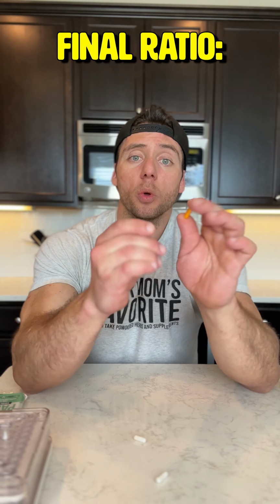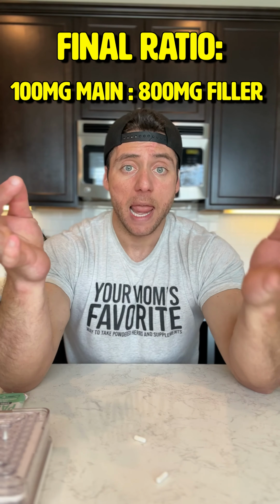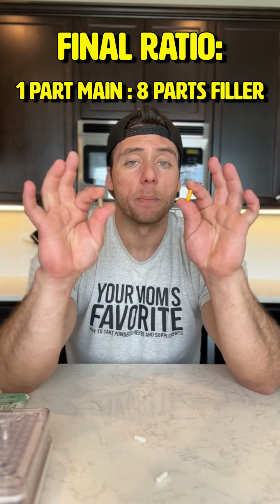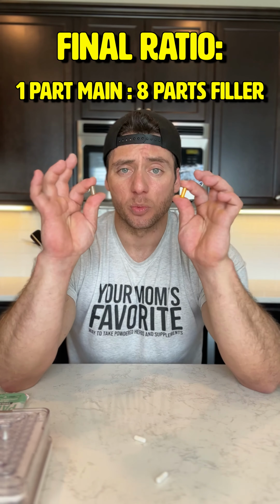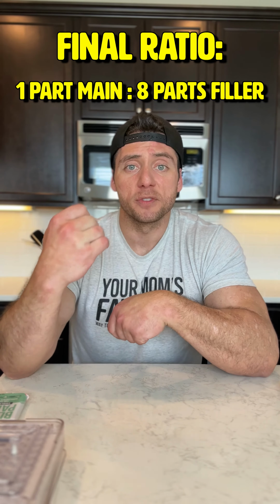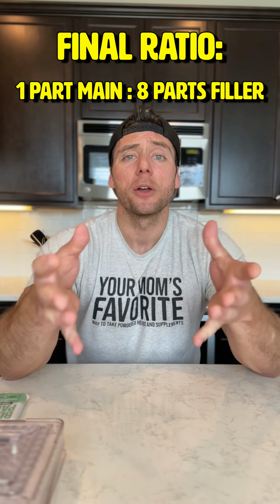And so now we know that each capsule will hold 100 milligrams of main substance and 800 milligrams of filler substance. That's a 1 to 8 ratio, 1 part main to 8 parts filler. All we have to do is mix powder at that specific ratio, and we can make as many capsules as we want. So for example, to fill 100 capsules, you know that 900 milligrams of the mixture is going to be needed for each capsule. 100 times 900 milligrams is equal to 90 grams of this powdered mixture.